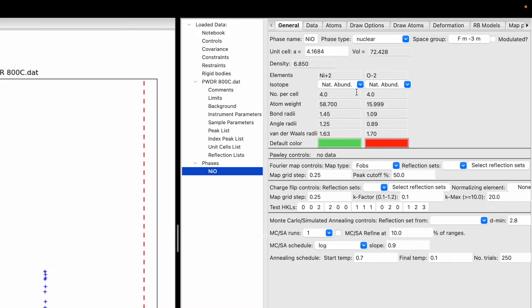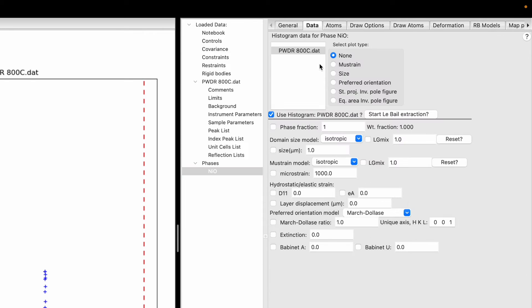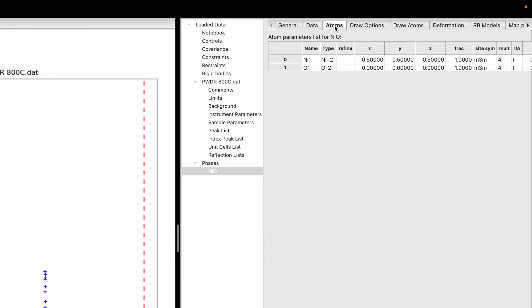In the General window we can see the unit cell is 4.1684 and all those parameters. Then if you go to Data, you will have four different variables: size, microstrain, LGMix, and LGMix. These we need to refine. The third option is Atoms. In the case of nickel oxide there is one nickel and one oxygen. The Cartesian coordinates for nickel are 0.5, 0.5, 0.5, and for oxygen are 0, 0, 0. The occupancy fraction is 1 and 1 — that is the default number.